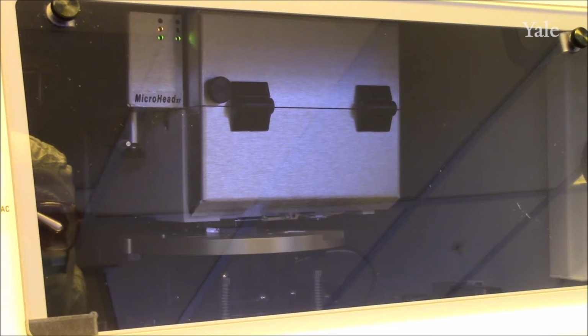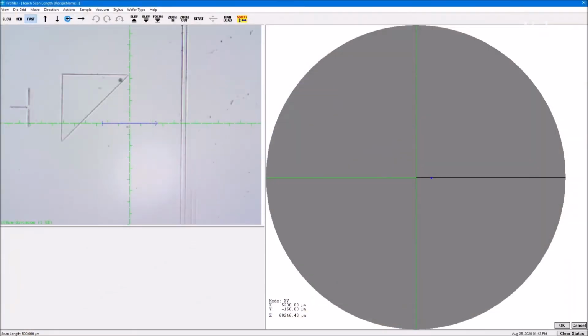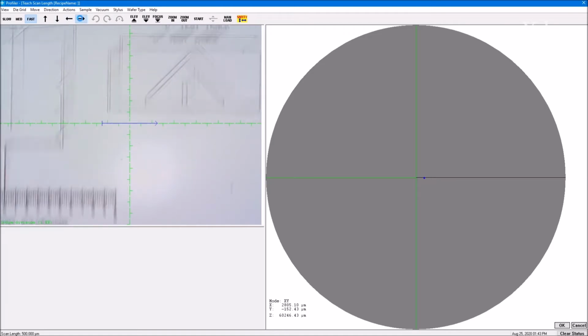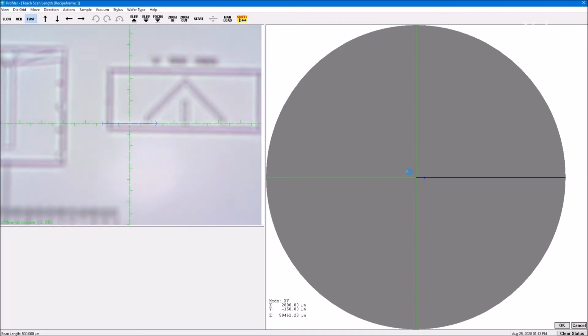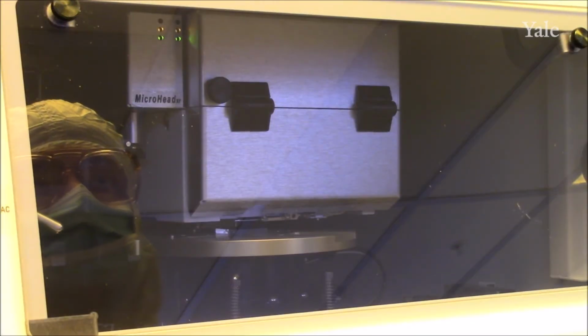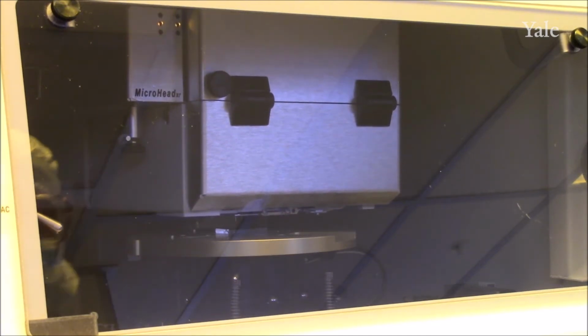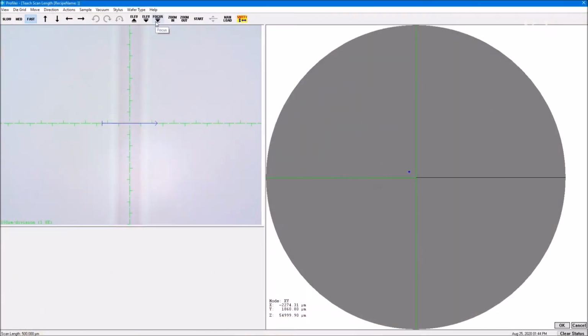As you navigate, take care of how the system moves around. For larger samples, to move across it, you can click on the wafer map on the right. This is a fast movement and will defocus the camera, requiring you to refocus it after you've arrived at your location. This defocusing is for the purpose of making sure the stylus tip is not struck or damaged by the sample.